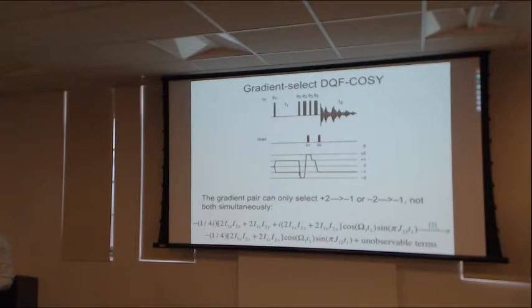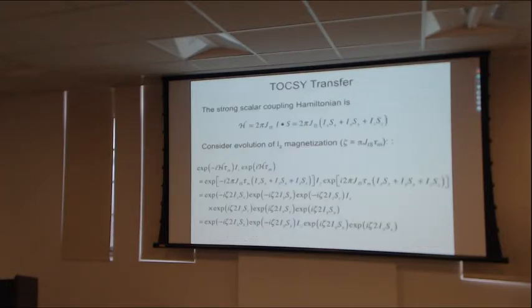So we can't detect +p and -p at the same time with the gradient. One of those will just get wound up even tighter in the helix by the second pulse. Only one of them can be unwound. So that's I think all I'll say about gradients right now.